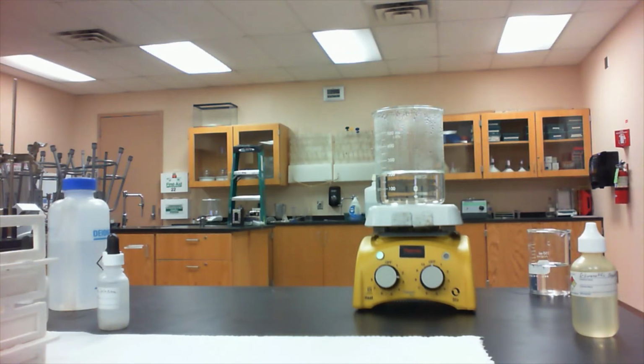So when we add our different reagents to our different sugars, we're going to be making some qualitative observations. That means we're going to try to record any color changes that occur. Keep in mind also that the lack of a color change is a perfectly valid observation, and that's very important for the experiment today. In order to interpret those color changes, you need to read the experiment ahead of time so that you know what the color changes correspond to in terms of the identity of the carbohydrates.